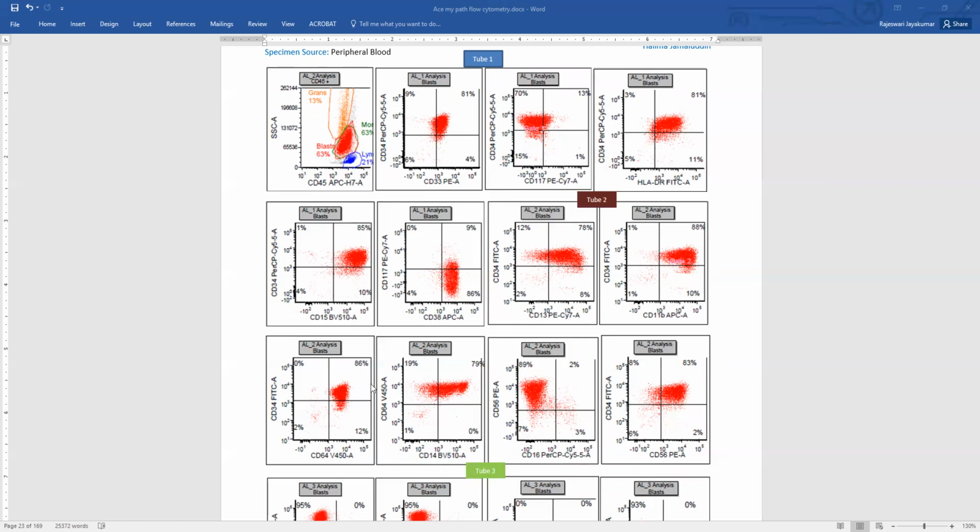So here we have CD64, CD14, and CD11b expression, which are all monocytic. CD14 is specific for monocytes because CD11b and CD64 can be seen in some myeloid precursors also. Some labs use CD11c as well, which can be positive in myeloids. And CD15 is also another monocytic lineage marker. So CD15 is positive here, pretty bright.